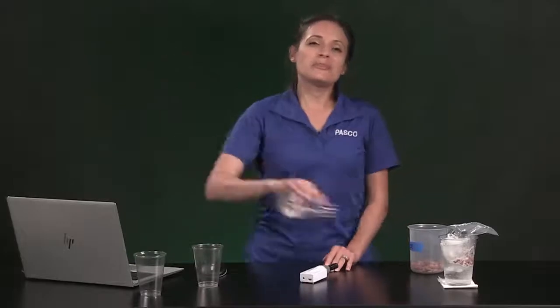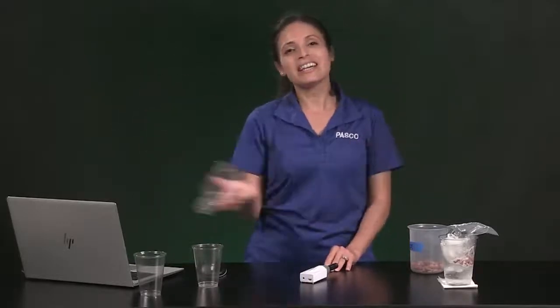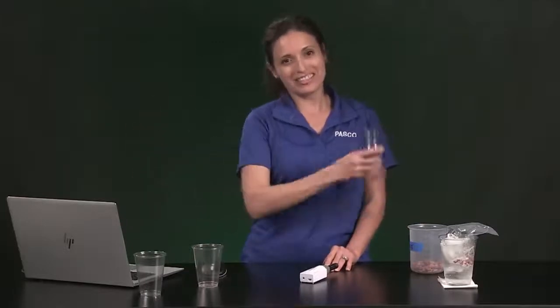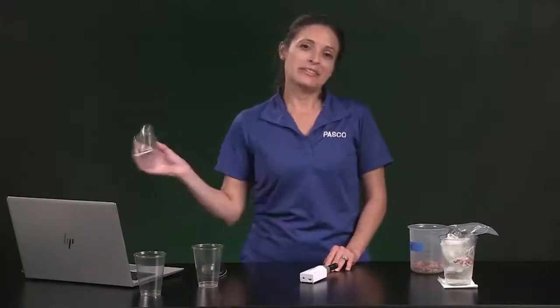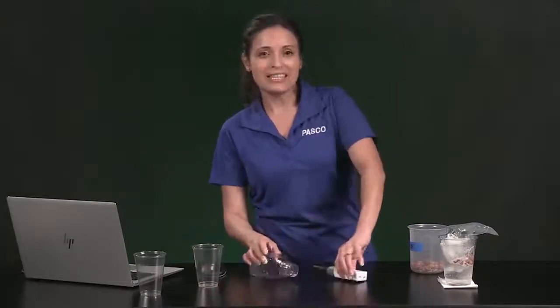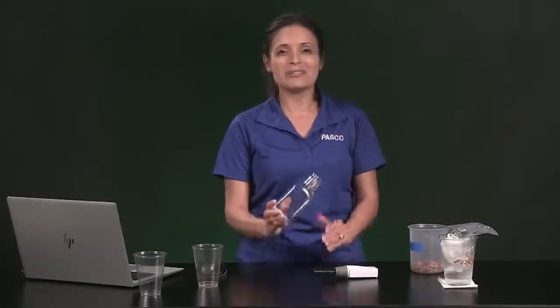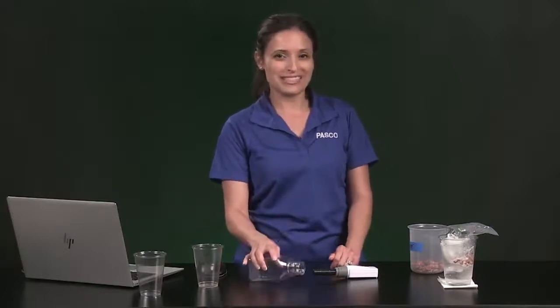Now, what would you do if you were asked to design an experiment where you had to change one variable and see how the carbon dioxide produced will change? Well, let's look at changing the temperature of germinating seeds. For the final run, we'll repeat the procedure with germinating seeds that have been chilled in ice water. Make a prediction of how germinating chilled seeds will affect the amount of carbon dioxide in the bottle. Pause the video and resume when you're ready.